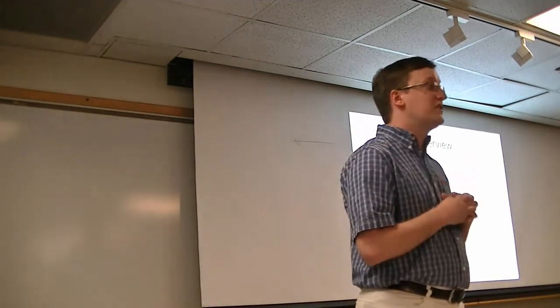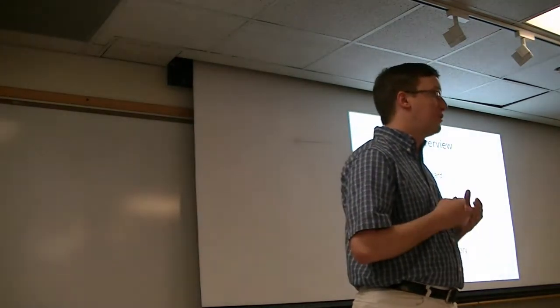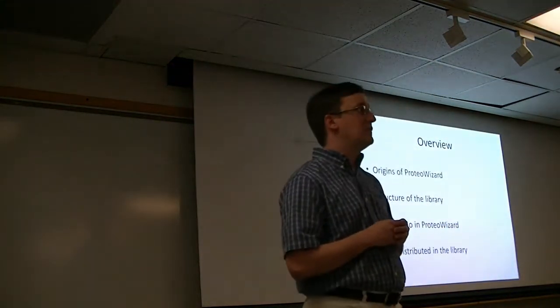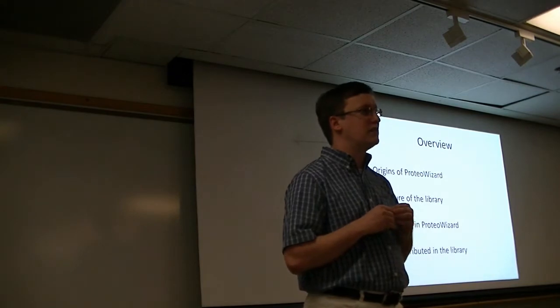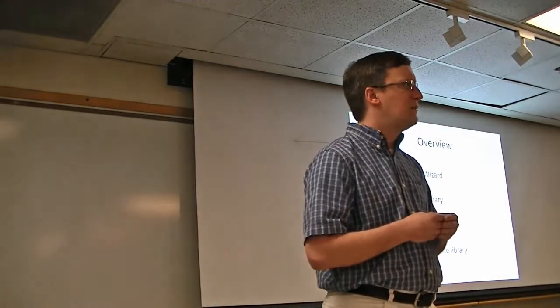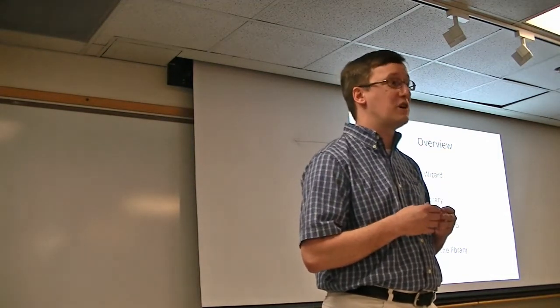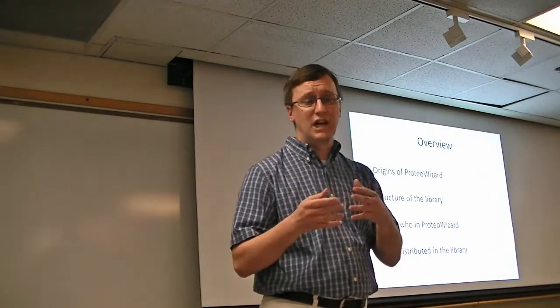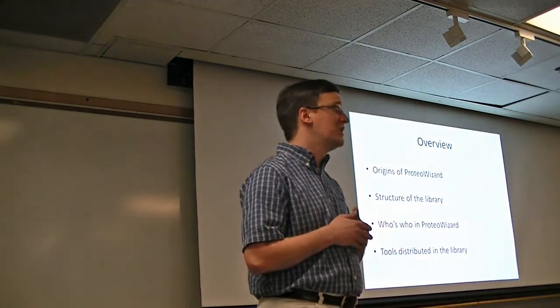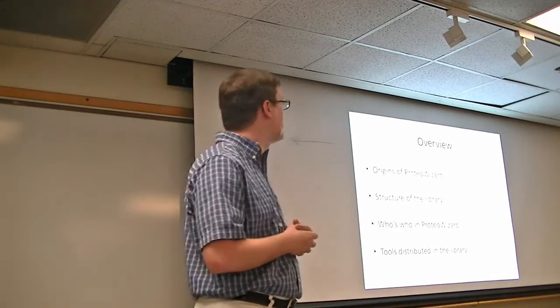So the first of the segments that I've put together for this workshop is really an overview of ProteoWizard. It may seem a little odd to start off a metabolome informatics workshop with a discussion of a proteomics tool, but in fact, ProteoWizard was designed to be useful in biological mass spectrometry in general, not just for use within proteomics. So we'll be talking a little bit about the origins of that project and the story of how it came to be what it is.